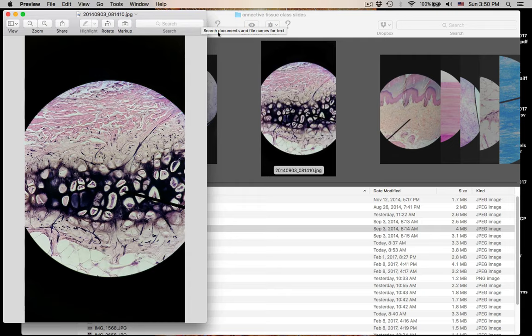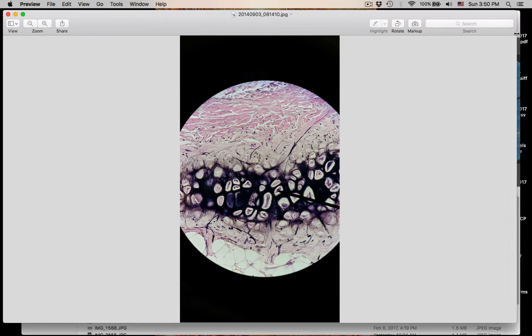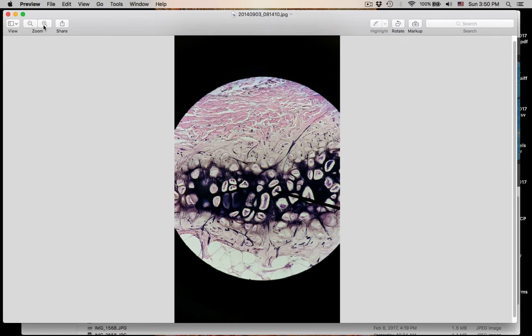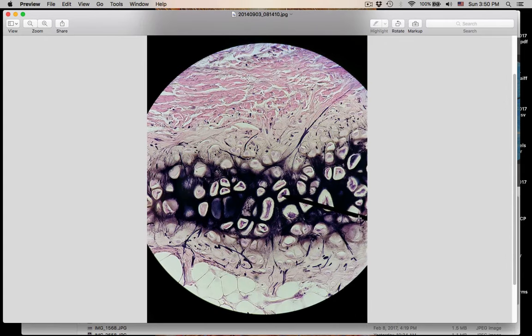Here's a really nice picture. The pointer is in this connective tissue. What's the name of this connective tissue? Two words. This is number five.